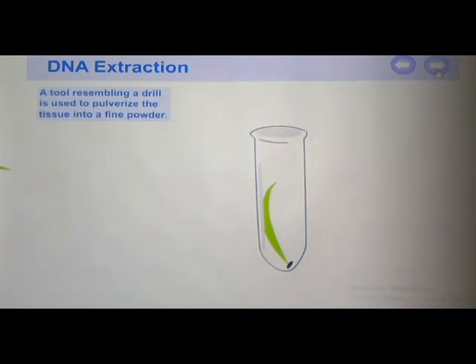A tool resembling a drill is used to pulverize the tissue into a fine powder.